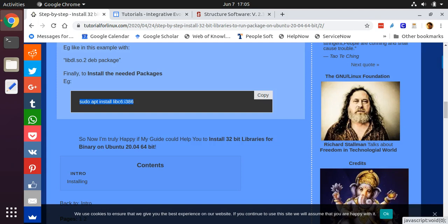Next, we need to download the command line version of STRUCTURE. I'm using the command line version because the software is so out of date that it's very hard to get the drop-down window version to run. In fact, I've only successfully been able to get it to run on a Windows machine, whereas the command line version can run within Ubuntu Linux.